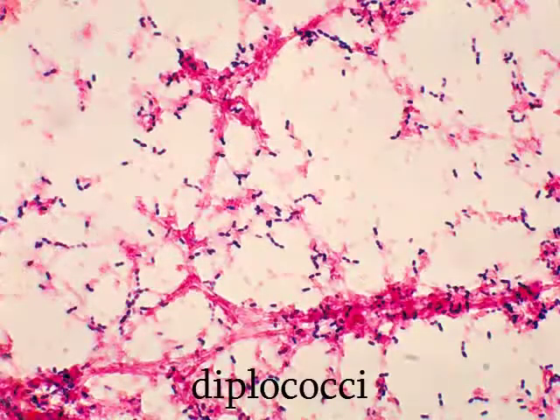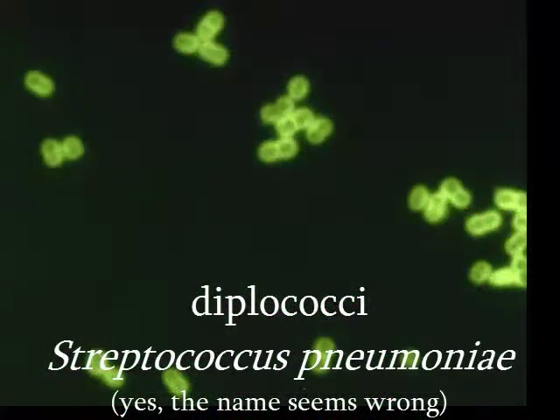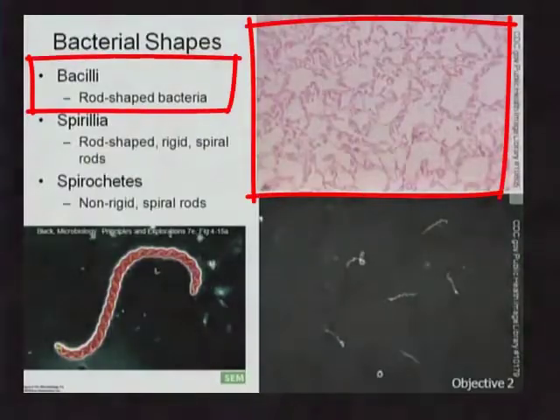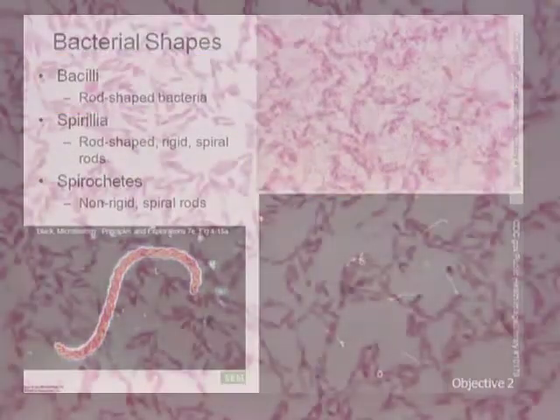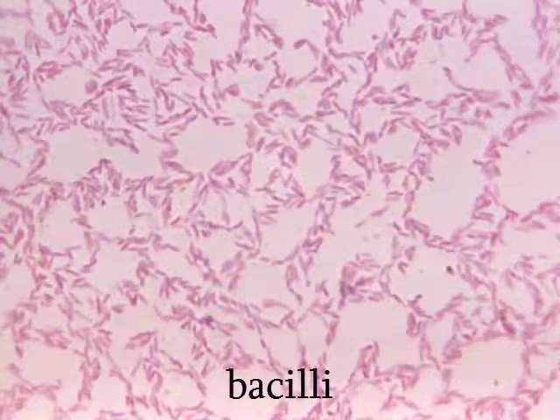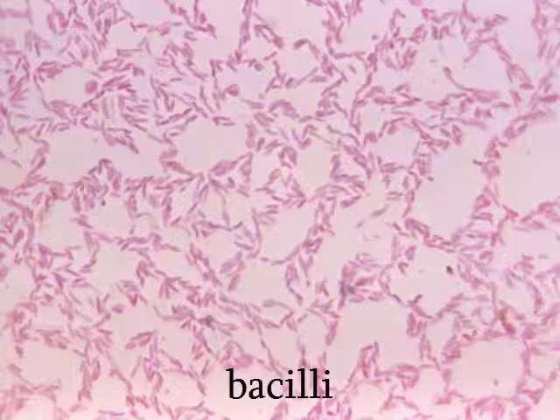Here are some more diplococci. You've got to look close to see them on the left, but on the right, that microscopy is wonderful, and you can see those diplococci forming end to end. That would be Streptococcus pneumoniae. It's basically the only organism that does that. Now here are our rod-shaped bacteria, bacilli, on the top right. Kind of hard to see. It looks like a mass of worms, maybe. But if you look really close and get down to the individual ones, there are individual rods there. And E. coli that we talked about earlier is a rod-shaped bacterium.